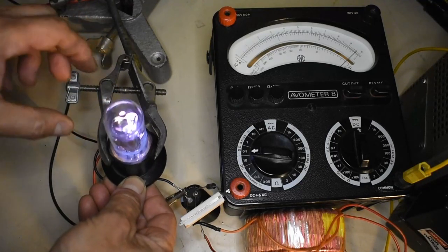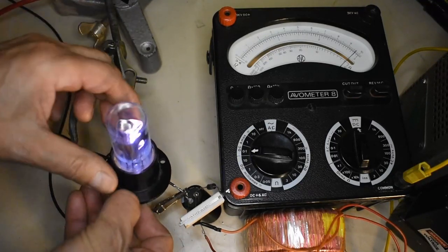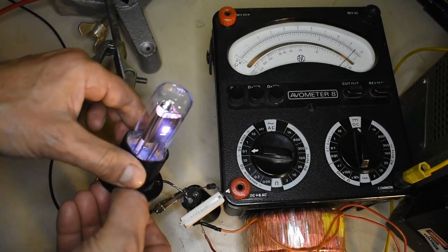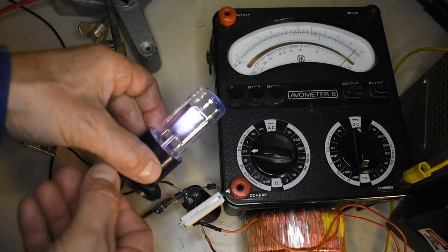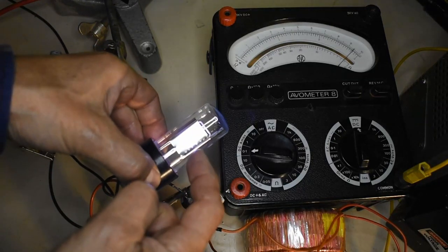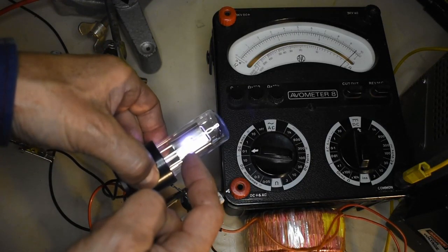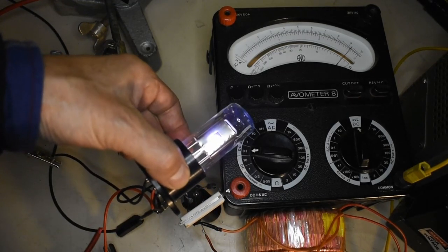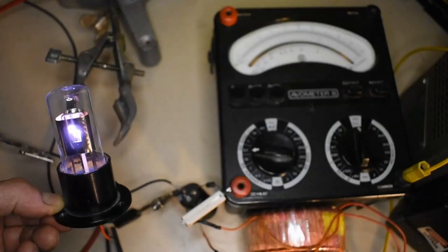So the actual light is emitted from a small window right on the front here. This is where the light is a bit more intense and will be used in any equipment running this type of light.